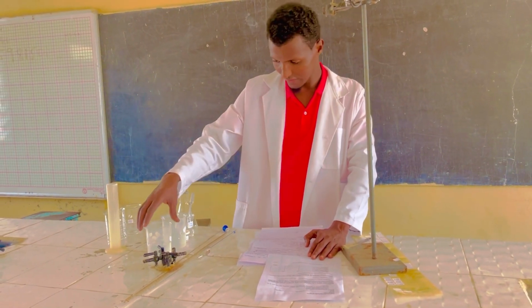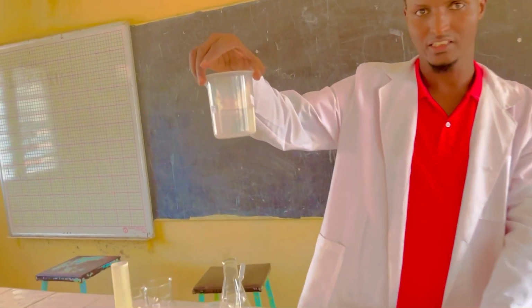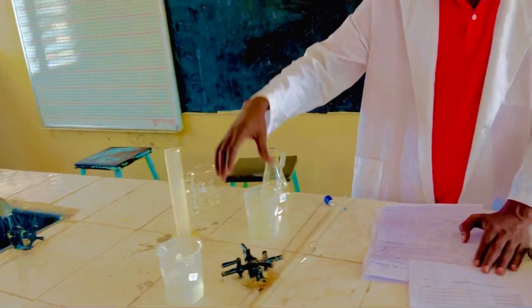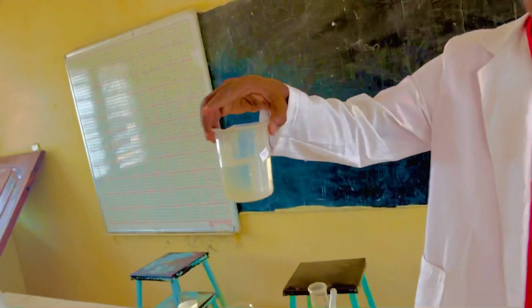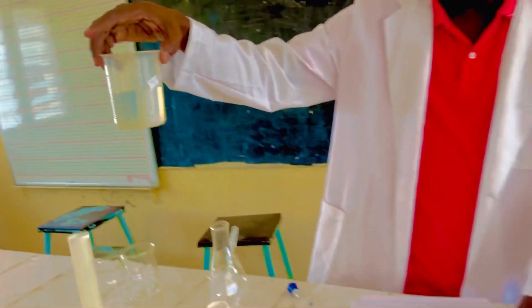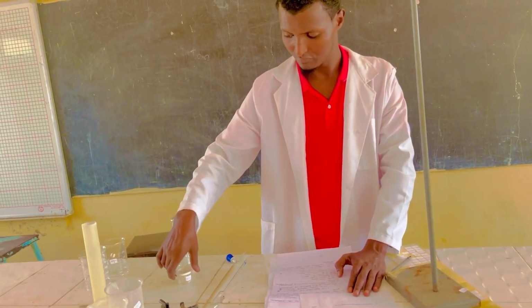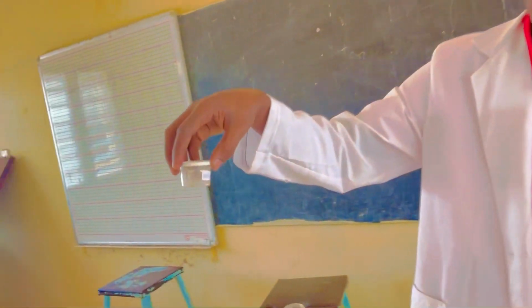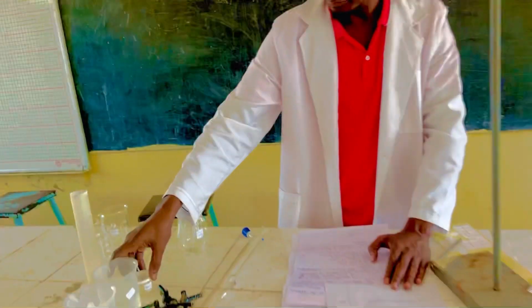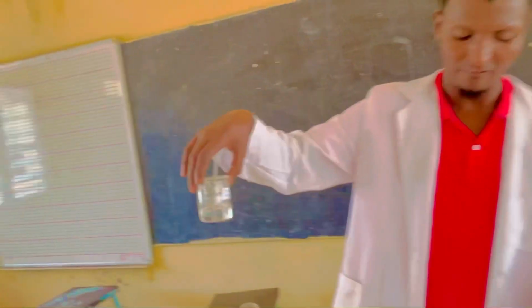You are provided with 1 molar hydrochloric acid, solution T, and 0.5 molar sodium hydroxide solution S, and anhydrous sodium carbonate of unknown mass, solid V. We are also given a phenolphthalein indicator.